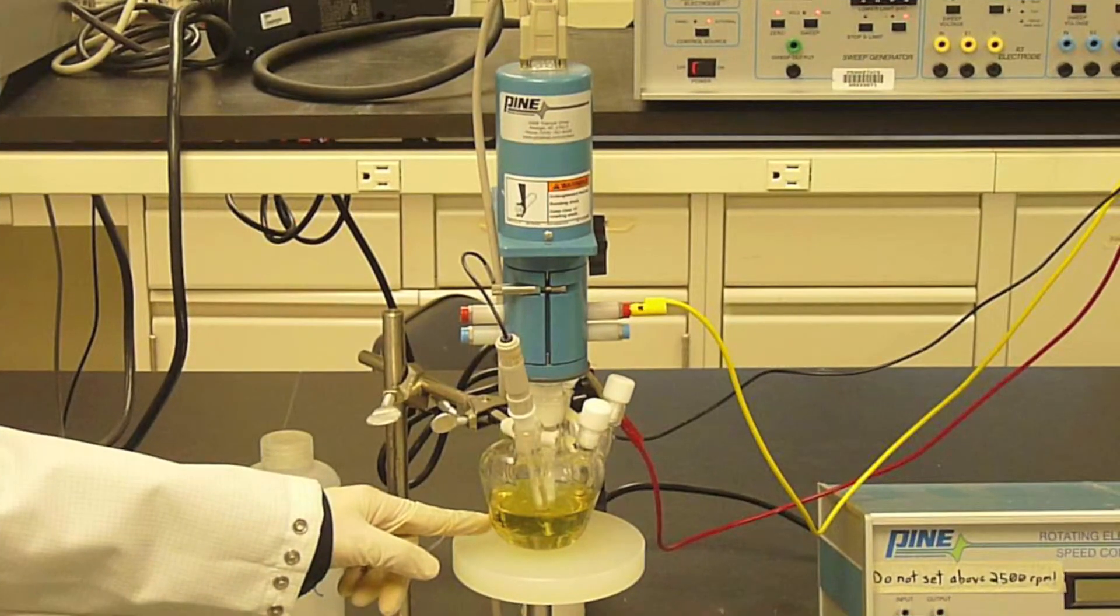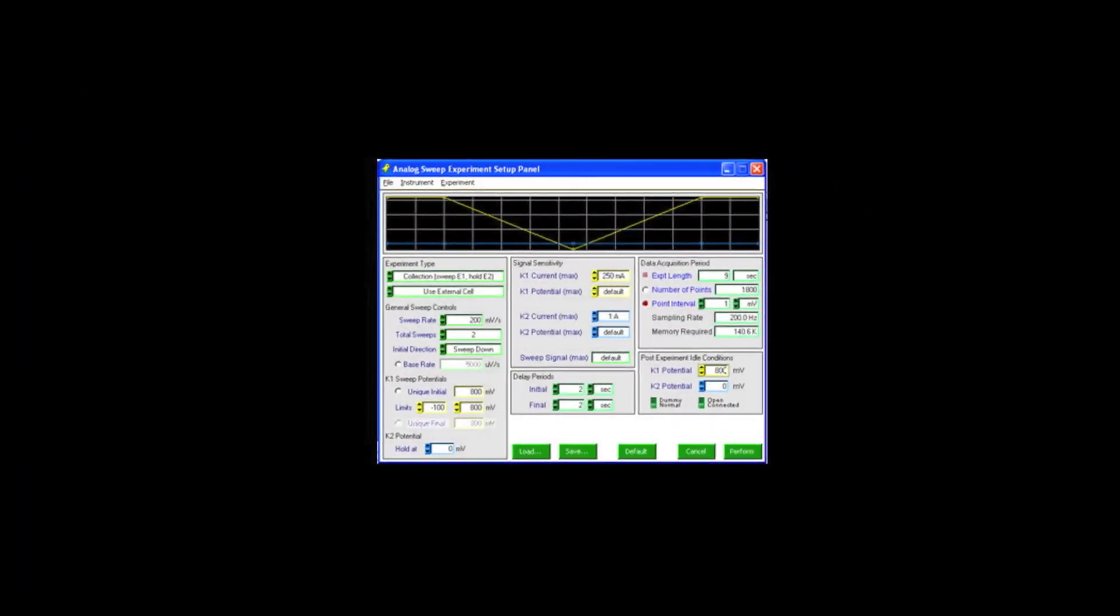With the background scan complete, replace the potassium nitrate solution with the potassium ferrocyanide solution and repeat the experiment. Re-check the bipotentiostat settings and readings. The bipotentiostat should again be in normal mode and the front panel voltmeter should again display the working electrode potential, E1, which should confirm the K1 electrode is idling near 800 millivolts.